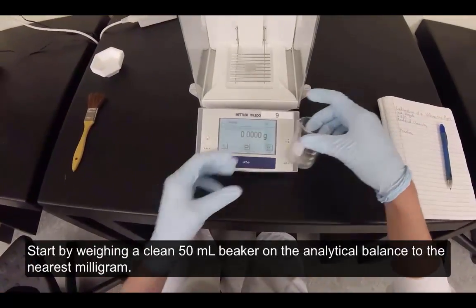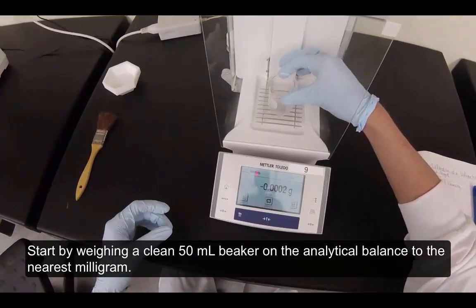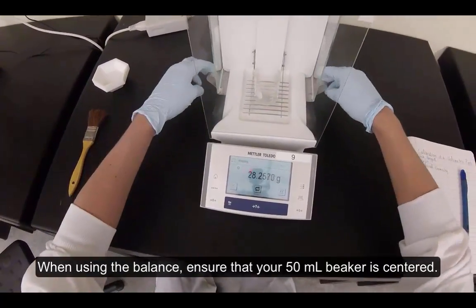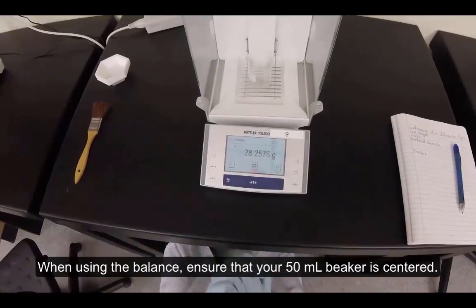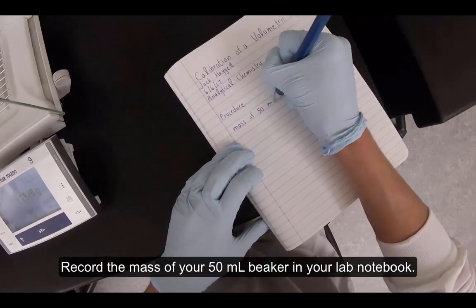Start by weighing a clean 50 milliliter beaker on the analytical balance to the nearest milligram. When using the balance, ensure that your 50 milliliter beaker is centered. Record the mass of your 50 milliliter beaker in your lab notebook.